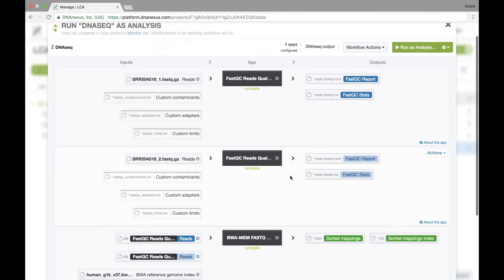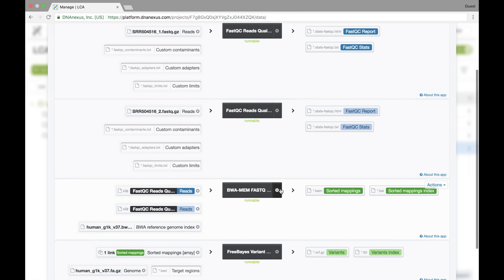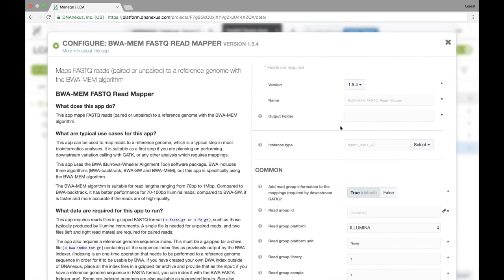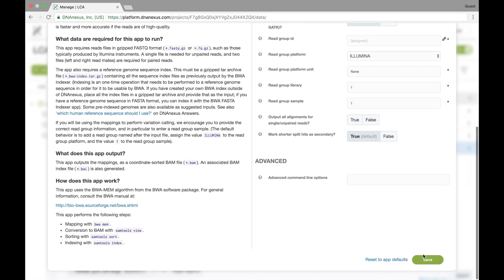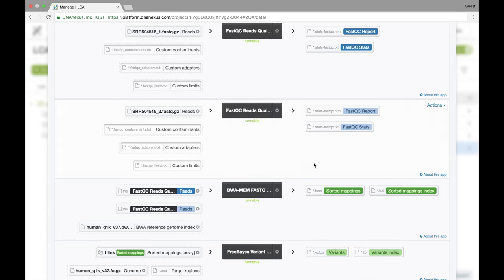For BWMM, we'll output to just a folder called BWA. Save that.